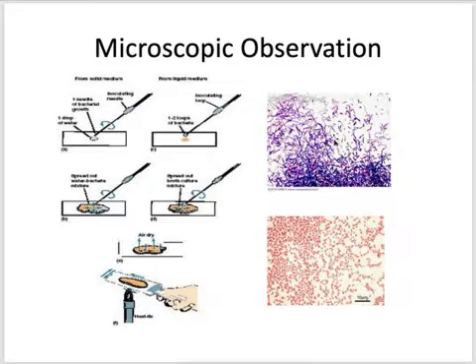These are the real bacteria. Bacteria have different shapes and morphology. The most common shapes are round or rod shape. The rod shape is called bacillus, and the round shape is called coccus. So coccus means round and bacilli means rod shape.